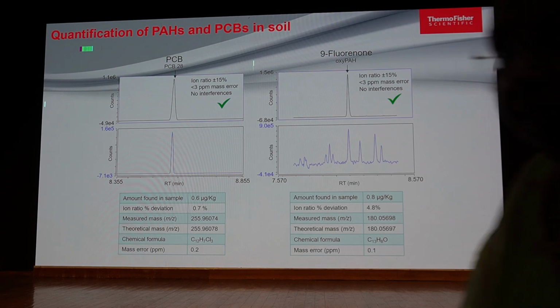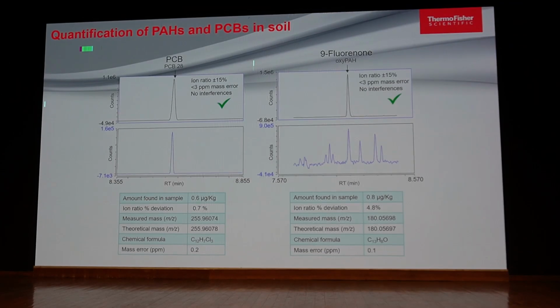As I mentioned, 5 ppm is the criteria we normally follow in food analysis. Based on that criteria, your mass accuracy is very nominal and very much acceptable in your results. The calculated concentration, through the calibration curve, you can get automatically in that report template itself, so you can have identification as well as quantitation data in one report template.